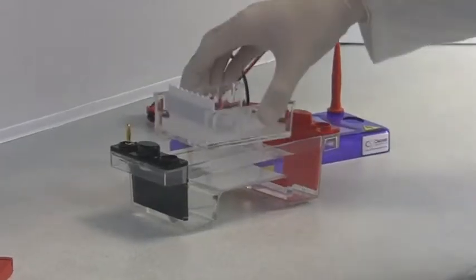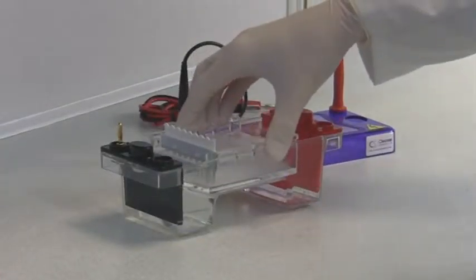UV transparent gel trays also serve as a convenient support for safe transportation of gels from the bench to the tank.